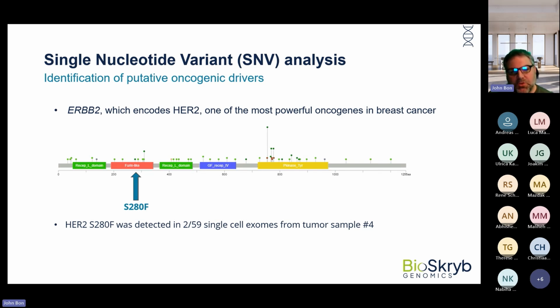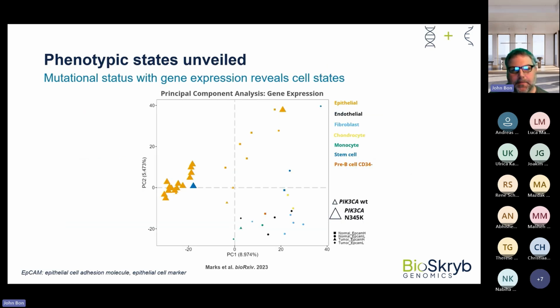Now, of course, 2 out of 60 cells, this is not clinically relevant. There is no basis for this right now, but in the future, we're hoping that single cell will be employed, because this data would have gotten washed out with bulk sequencing. You would not have seen it. So it's very important to recognize the power of single cell technology.